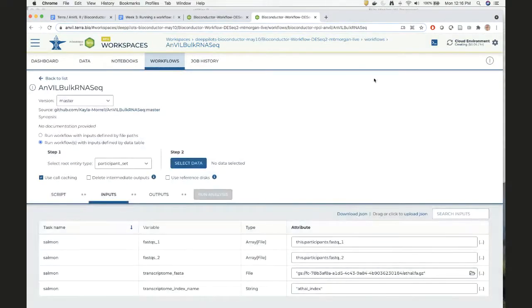You look up at the clock and realize that time's going by pretty quickly. So I'm just going to walk through this very briefly. We're just going to click some buttons without any deep thought about this, just so that we get the workflow running.